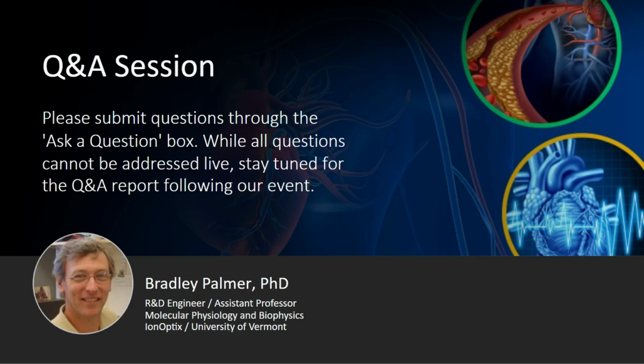Thanks, Brad. Okay. The first question that I will ask you, thanks for your talk. How does one minimize tissue damage during vibratome preparation of the cardiac slices?